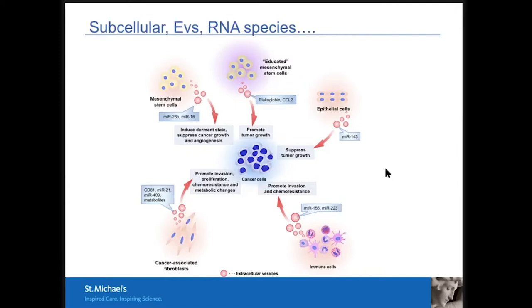The point being here that we can not only look at protein, but also RNA. We can not only look at cells, but subcellular things like extracellular vesicles that are a very hot topic in the field to date.